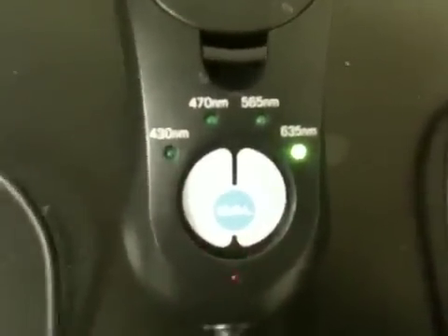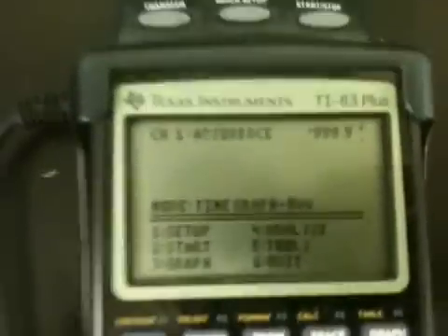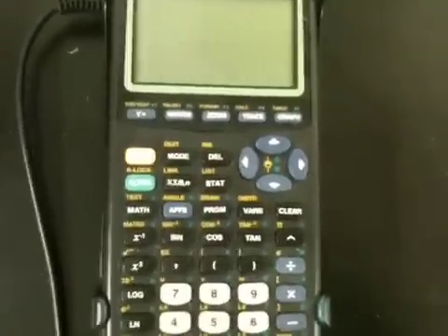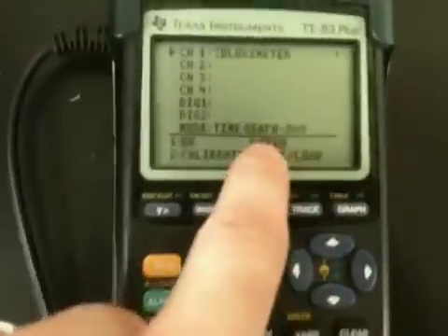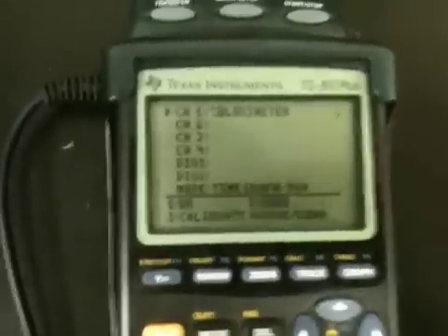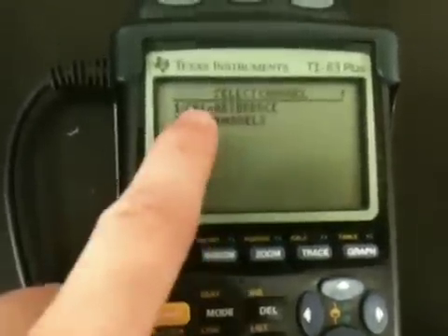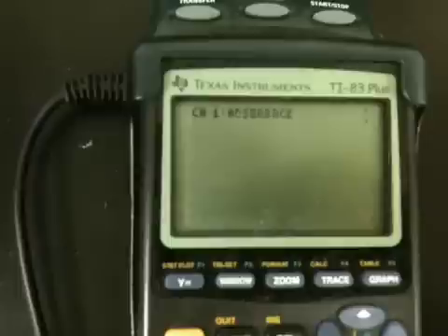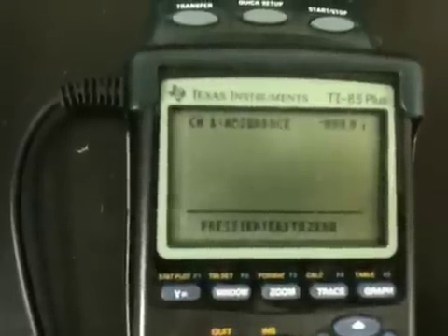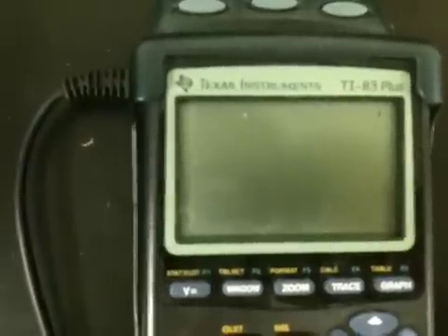In theory, what we should see on the calculator is zero, but it doesn't say zero. So we've calibrated the colorimeter, but we haven't calibrated the calculator. I'm going to click 1 to go to setup — you want to make sure that you're writing this stuff down. Then what you want to do is hit zero. You'll see it says number 3 and zero, so I'm going to hit the number 3 button on the calculator. It's going to go to another screen asking you to select the channel you want to zero. We want to select channel 1 because that's where our colorimeter is plugged in. I'm hitting 1, and then you should see a number pop up and it'll say press Enter to zero. So I'm going to hit Enter, and it goes to hopefully zero.